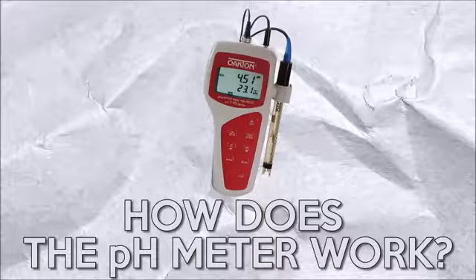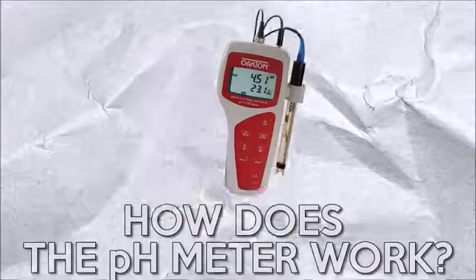In this video we are going to talk a little on how a pH meter works and for this I need to spill some chemistry mumbo jumbo in order for you to understand so please bear with me on this.